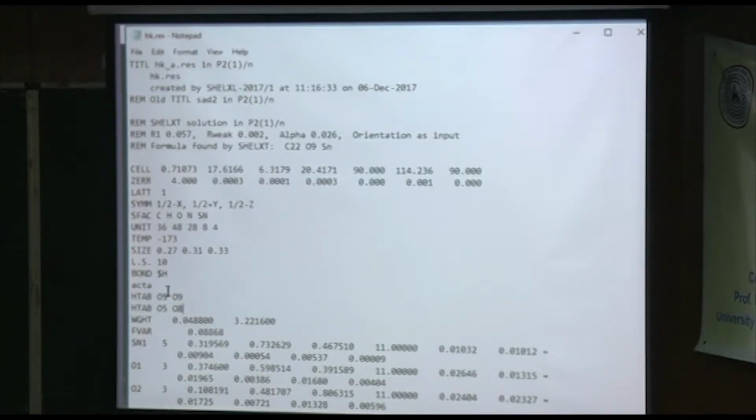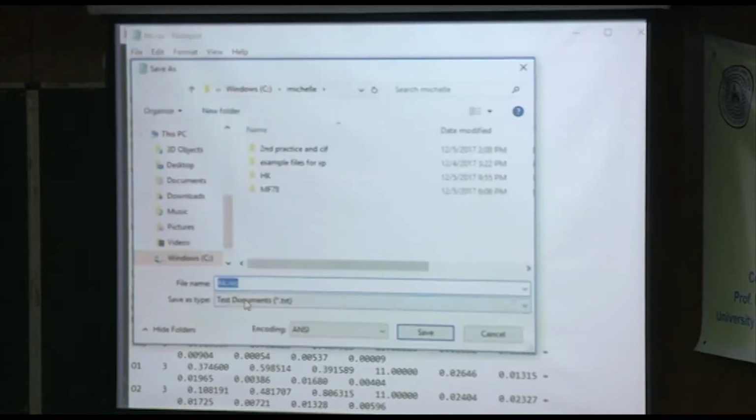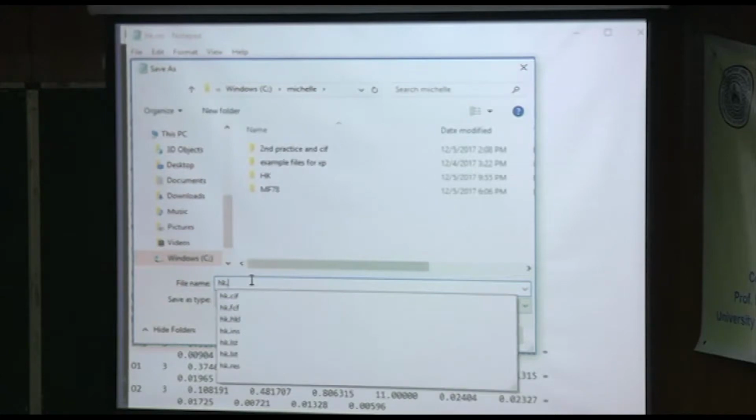Okay, so a little more fiddling in. This is done now. I was confused about the ligand because it looked like a really strange thing to me. So I went to the CSD to see if it had been reported before.